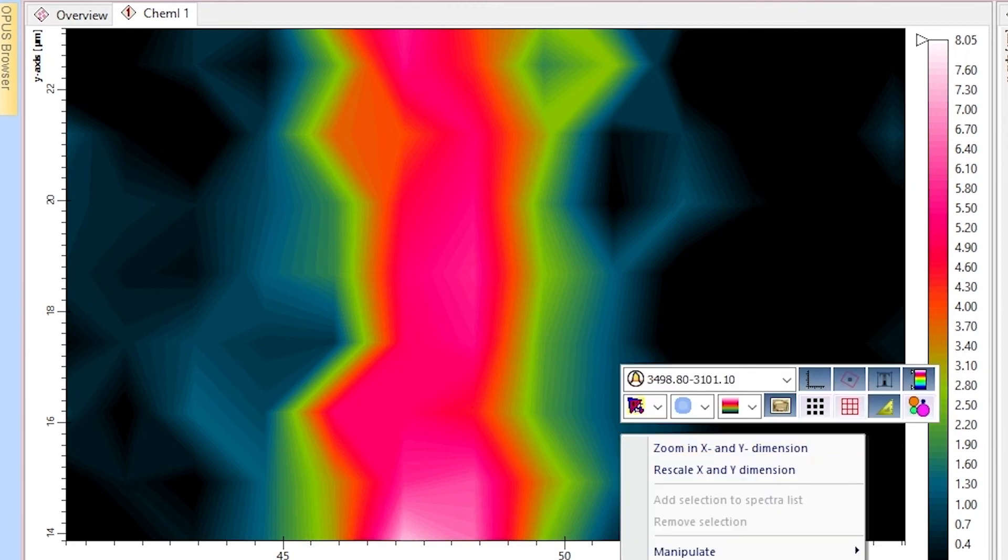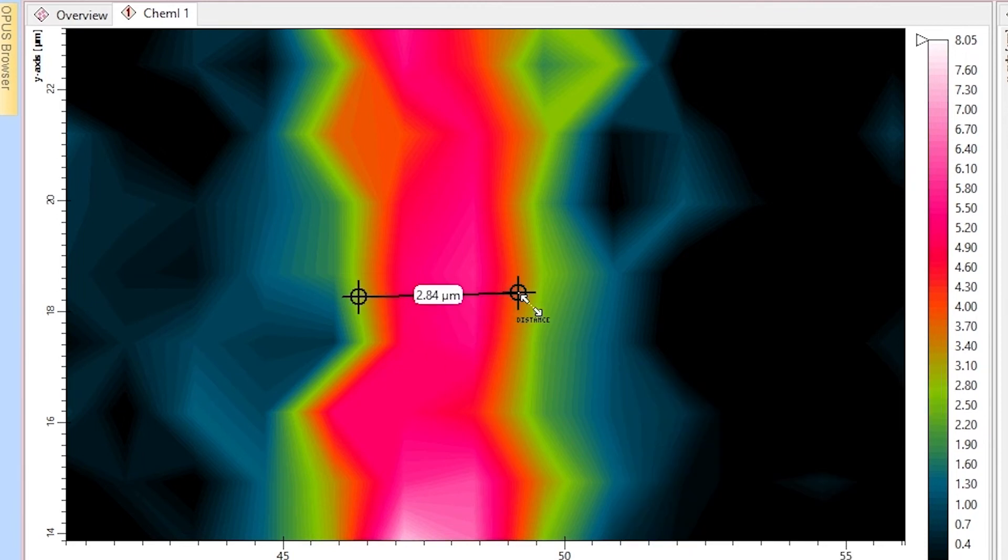The approximate thickness is 3 micrometers, which is within the specification of the supplier and the foil is verified.